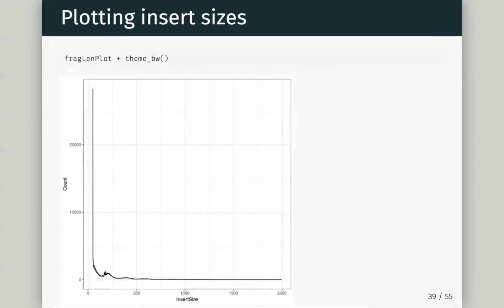But theoretically, you could split it up by taking your paired GAlignmentPairs object and subsetting it so that the ones with insert sizes less than 100 we can consider nucleosome-free signal. Those between the ranges dictated from Greenleaf will say mononuc, and those between these regions will be dinuc.